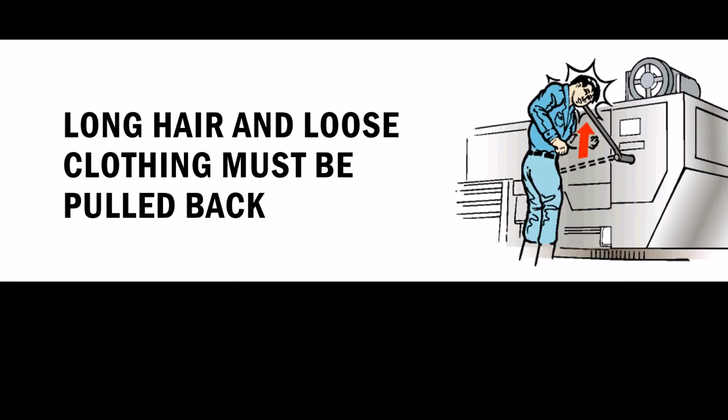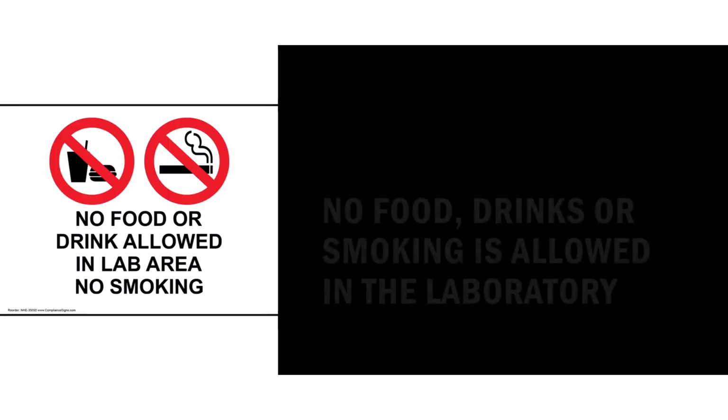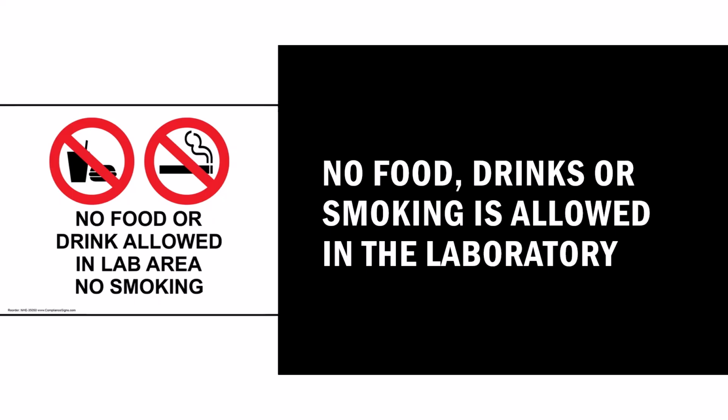Next, long hair or loose clothing must be pulled back and secured from attachment or potential capture. Also, no food and drink are allowed in the lab area, and also no smoking.